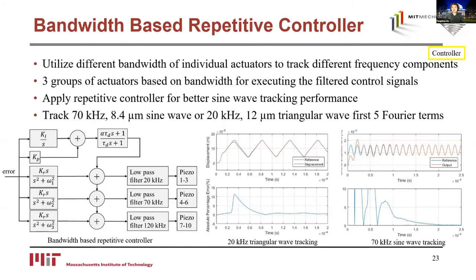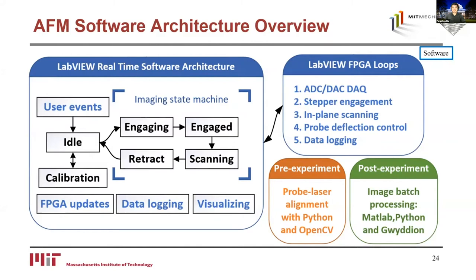Now let's take a look at the software interface implementing these controllers. The overall software architecture is shown in this diagram. The main imaging software is implemented using LabVIEW on a National Instruments PXIe hardware platform. The real-time software uses an event-driven state machine architecture to handle high-level user interactions and manage imaging state transitions — including idle, engage, scanning, and retract — with an additional calibration state. The FPGA system uses five parallel loops for low-level hardware interfaces. The pre-experiment software for probe-laser alignment is implemented using Python and the OpenCV library, and the post-experiment software for image batch processing is implemented in both MATLAB and Python.